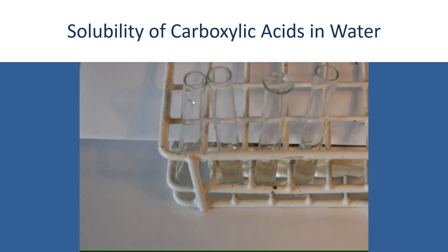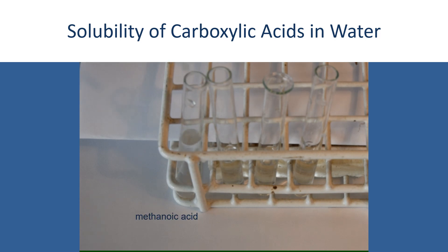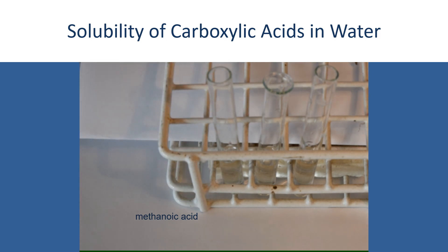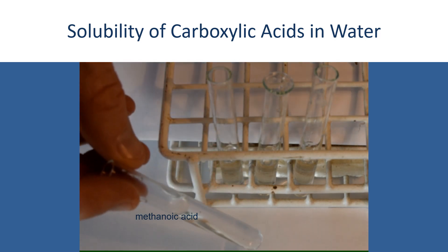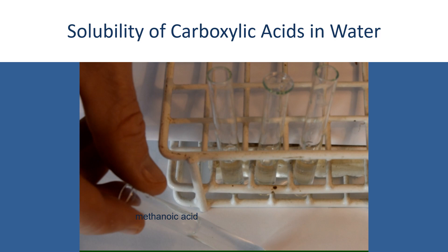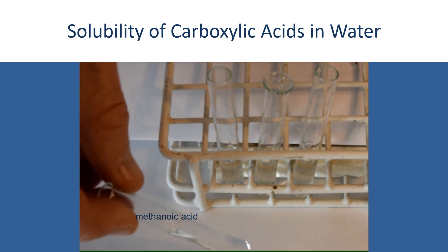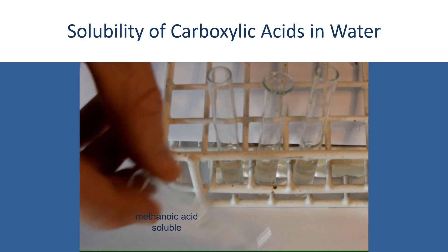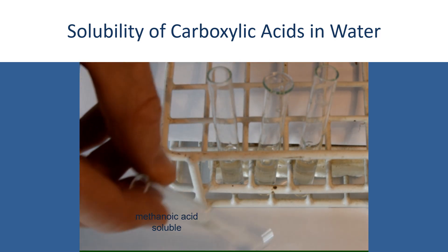Starting with methanoic acid, I'm going to add that in there, give it a little shake, and you can see that methanoic acid is completely soluble in water.